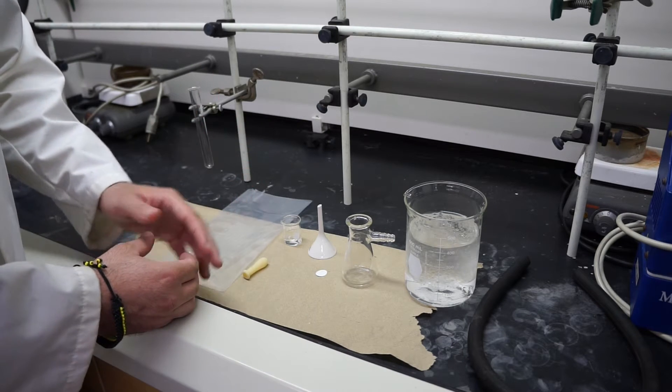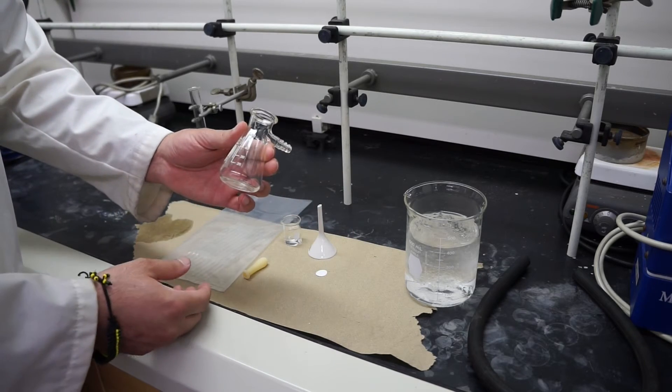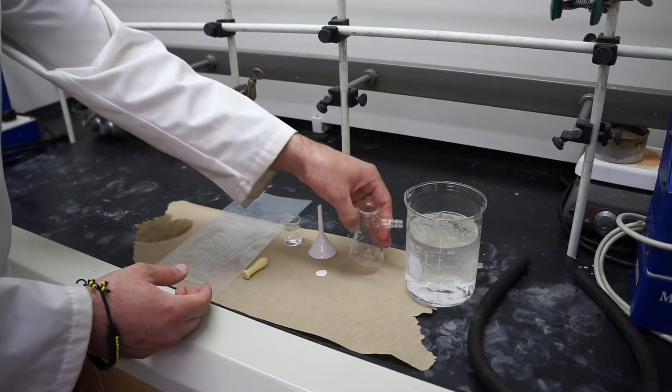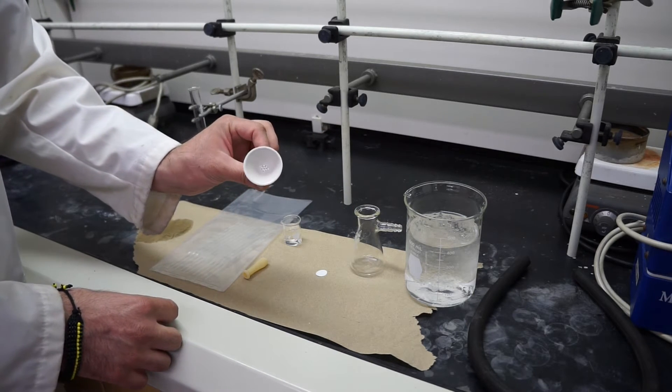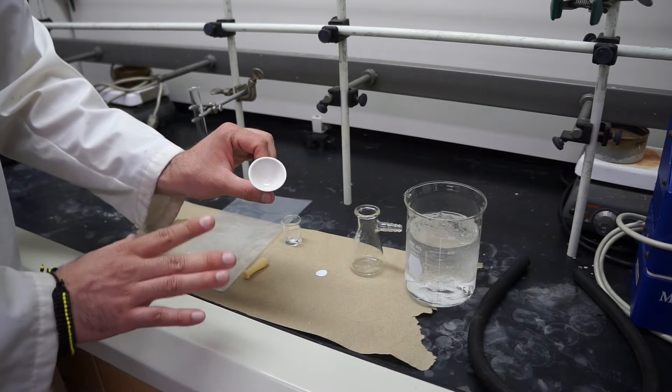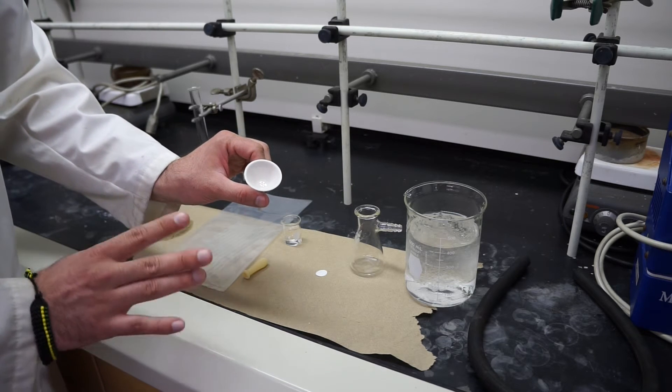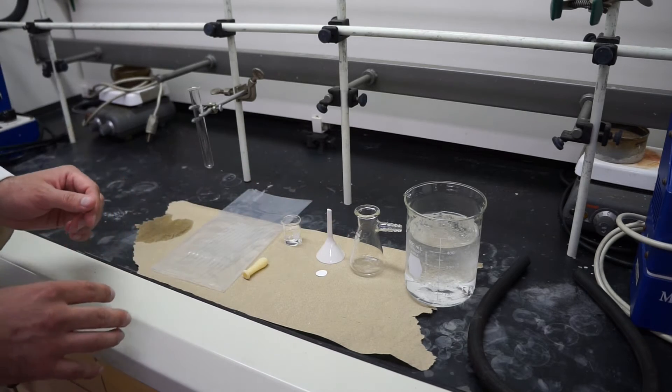For the workup which is isolation of the product, we're going to use a filtration flask, small filtration flask, as well as a Hirsch funnel. The Hirsch funnel works just like the Buechner funnel but it's used for smaller quantities. If you don't have as much crystals, Hirsch funnel is usually the way to go to minimize loss of your product.